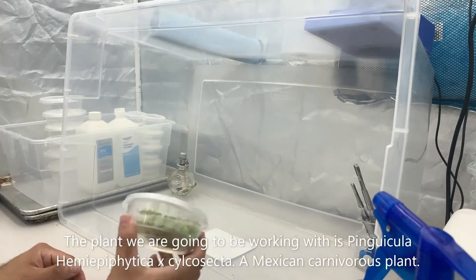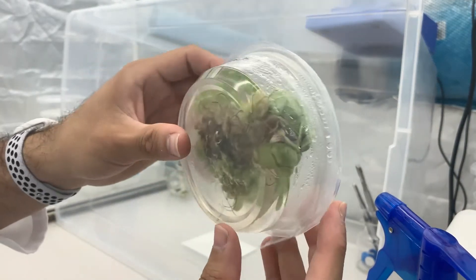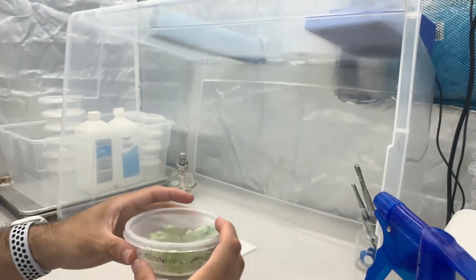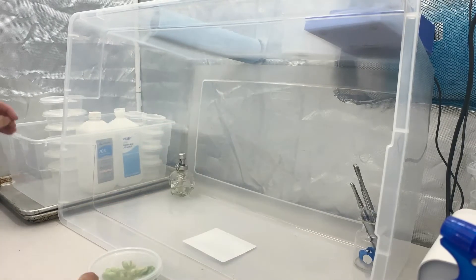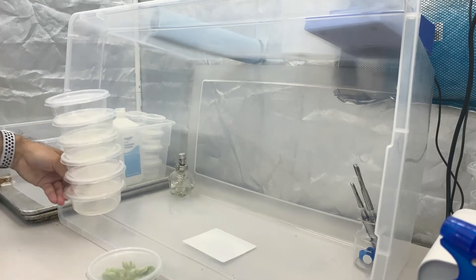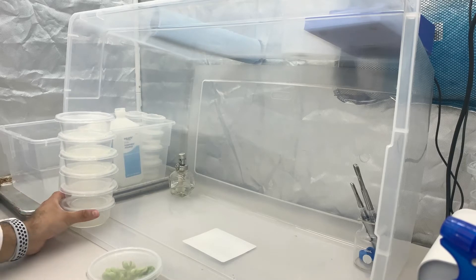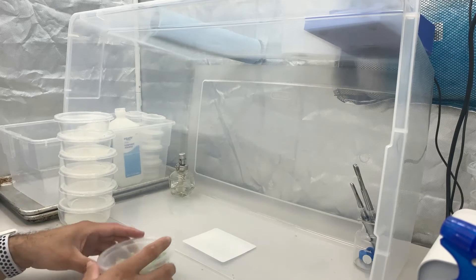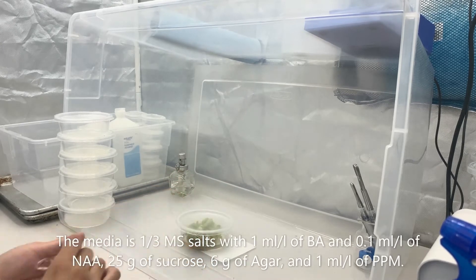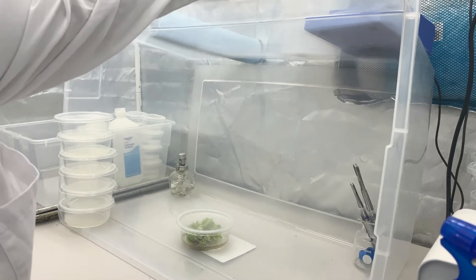The plant we're going to be working with today is Pinguicula hemiepiphytica cyclosecta. It's a Mexican carnivorous plant. The media is comprised of one-third MS salts with one milliliter per liter of BA and 0.1 milliliter per liter of NA, 25 grams of sucrose, 6 grams of agar, and one milliliter per liter of PPM.